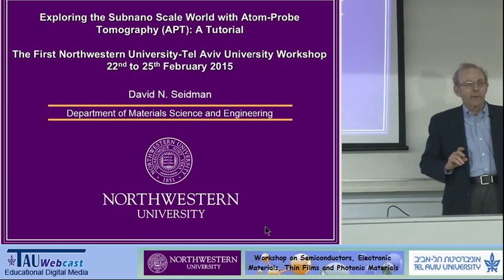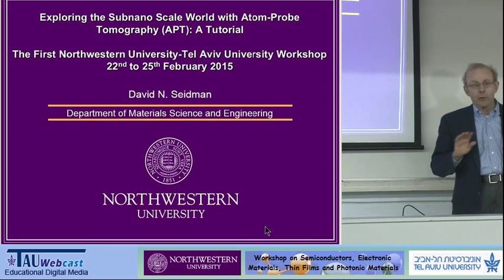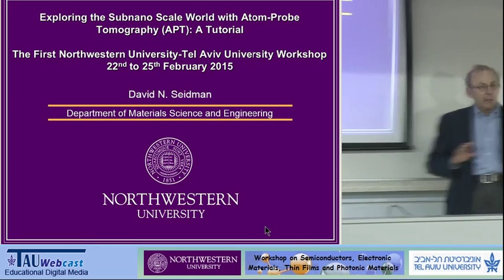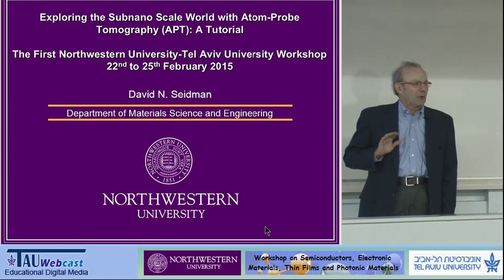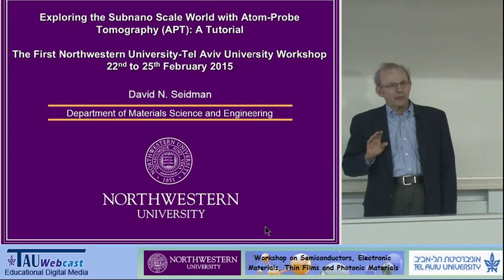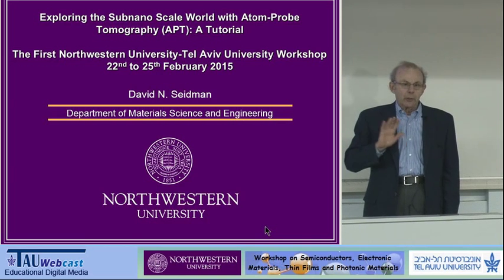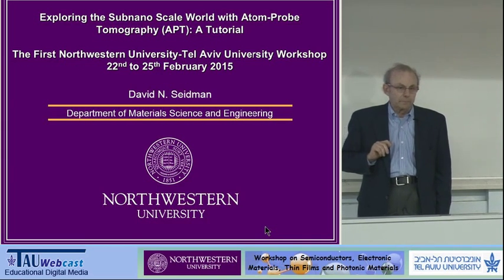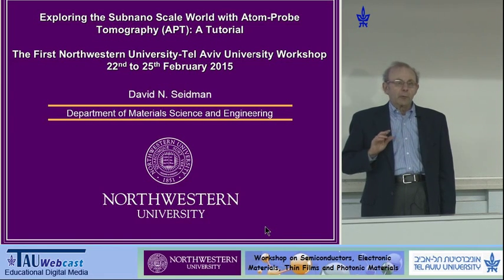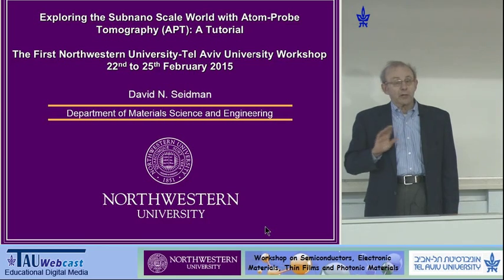So what I'm going to do in this talk is give an overview of atom probe tomography as a technique, and it'll be longer than the one that I gave on Sunday, so there will be some additional slides. I thought I would try and give you the basics. Unlike Peter Voorhees, who very systematically went through the whole basic theory of phase field modeling, what I'm going to do is give some examples that explain the technique. And only part of it is published.